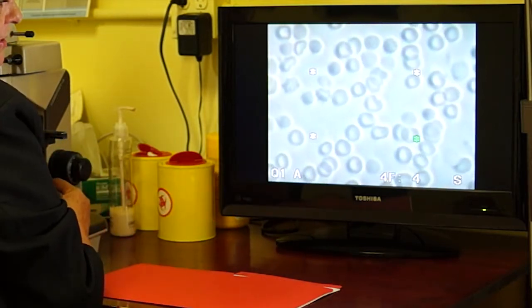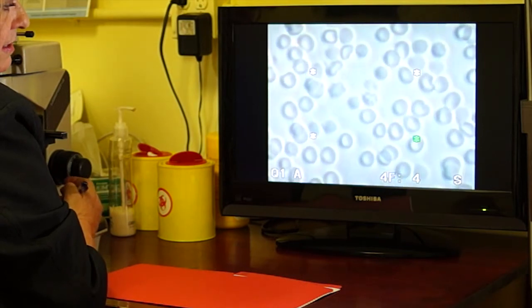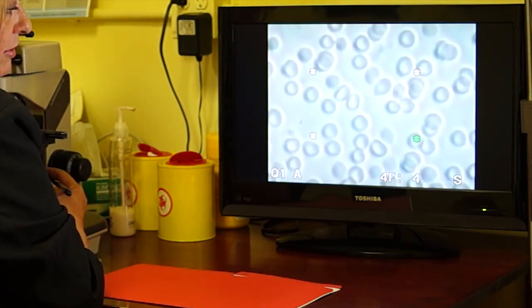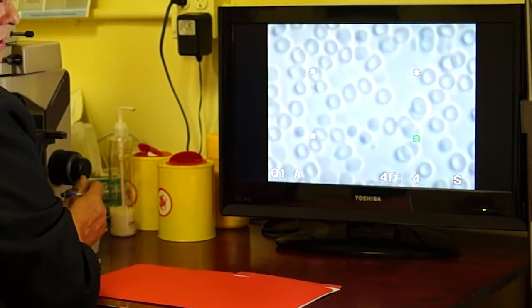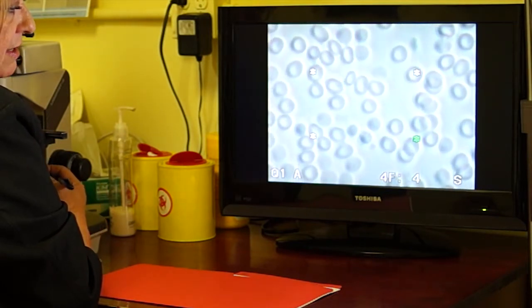This blood cell here has some bacteria on it. Can you see that bacteria, how it's a little spiky on the edges of the cell? Yeah? Yes. Okay. That can be an indication that you're coming down with a flu or a cold. Cells here like these ones are not mature, they're immature, and it's your spleen's responsibility to mature your blood cells.